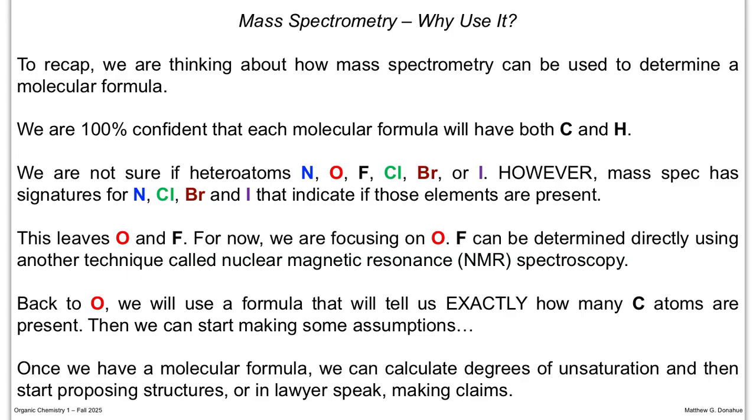So why are we using this? We want to, again, figure out what heteroatoms are there. And there's a lot of little subtleties in these diagnostic signals that we have to recognize.